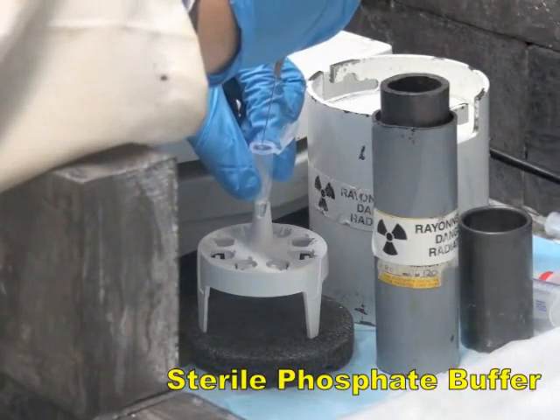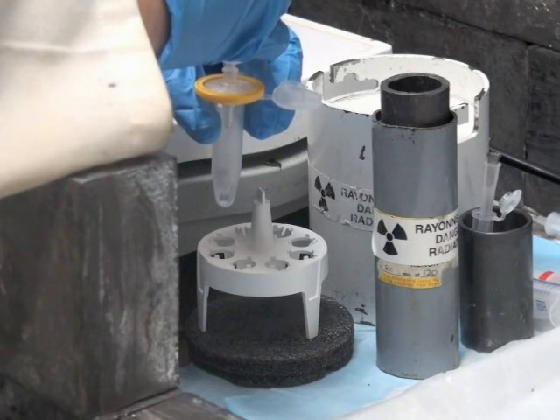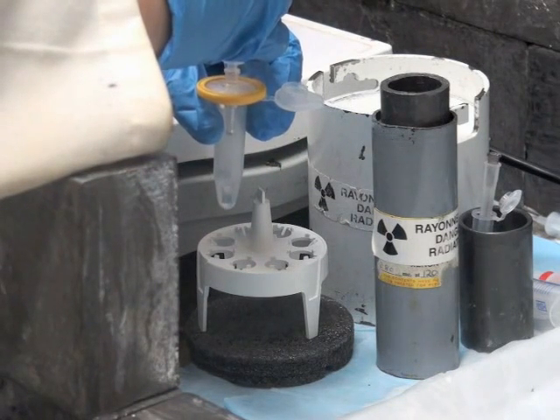Dilute with sterile phosphate buffer for injections. Pass the resulting pure fluorine-18 labeled SIFA peptide through a sterile filter.